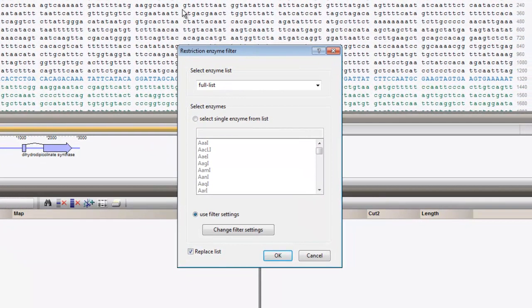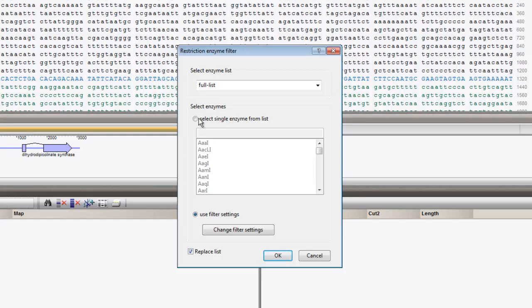I will enable the option to select a single enzyme, and I will choose one from the list. Press OK.